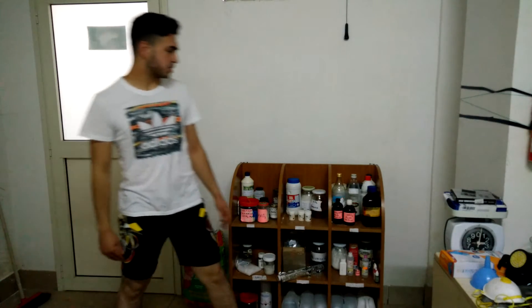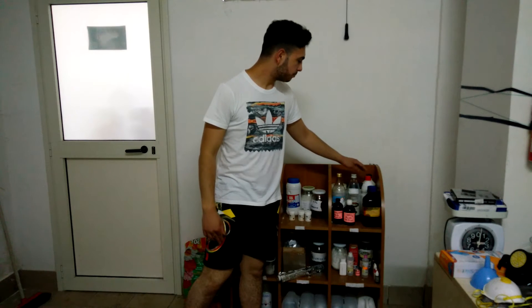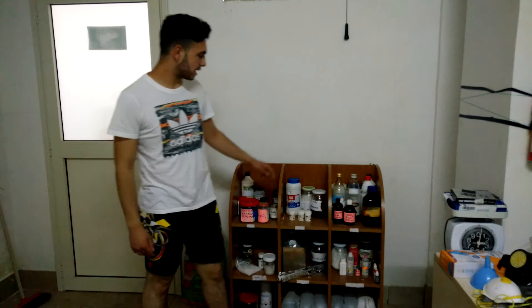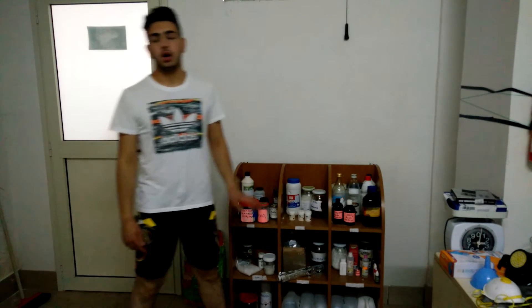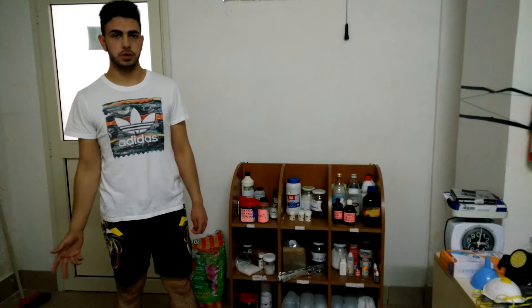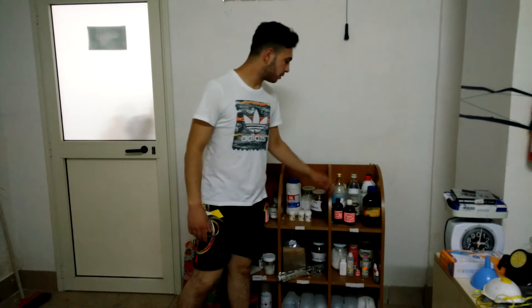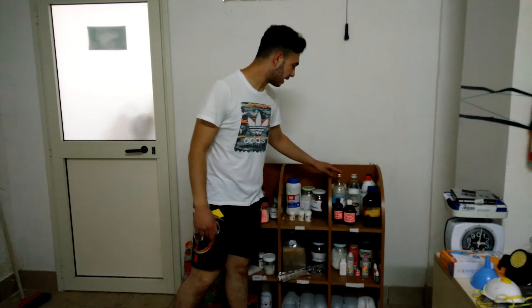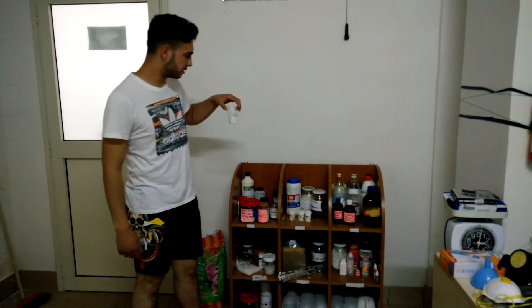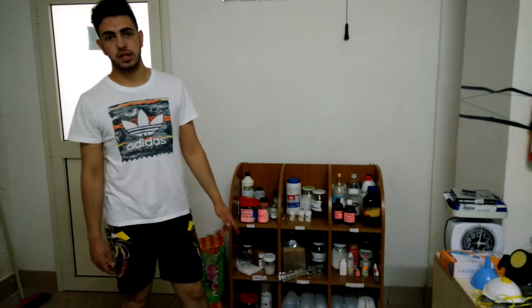The more common reagents are, for example, sulfuric acid, hydrochloric acid, and also other reagents like sodium hydroxide. Also, we want to note that there are some things that you can take from your home that can be used as chemical reagents, such as acetic acid, sodium chloride — that is the common salt — and also sodium carbonate, and of course water.